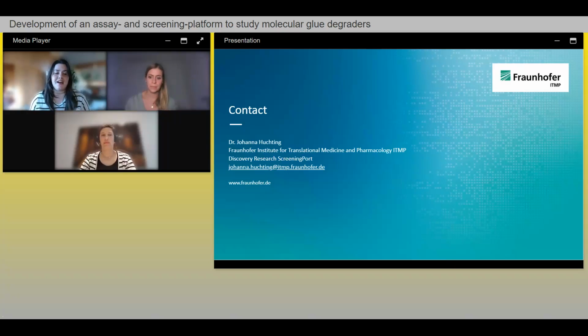Sorry, I was muted. Excellent, thank you. And then our next question, back over to you, Johanna. This says, in your workflow, you have shown a medium aspiration step before cell lysis. Is this strictly necessary? So it's not strictly necessary.